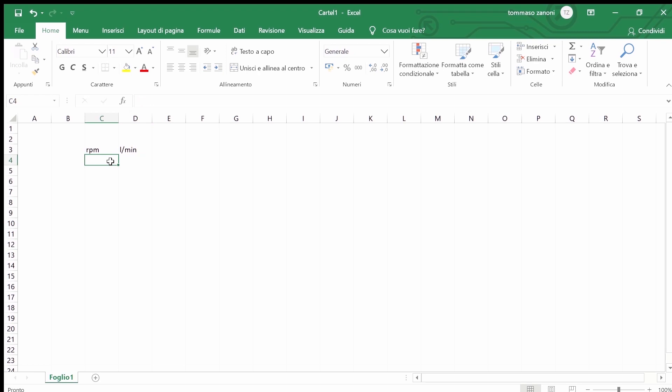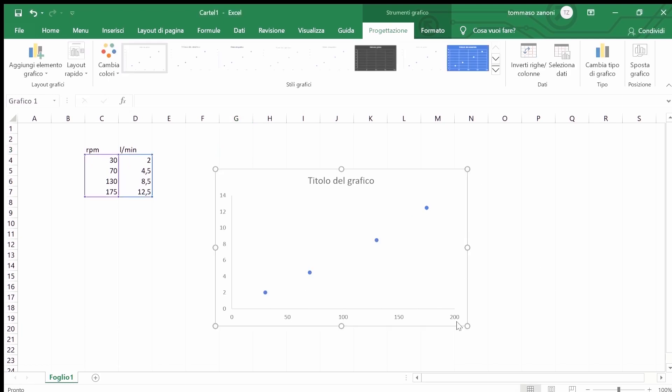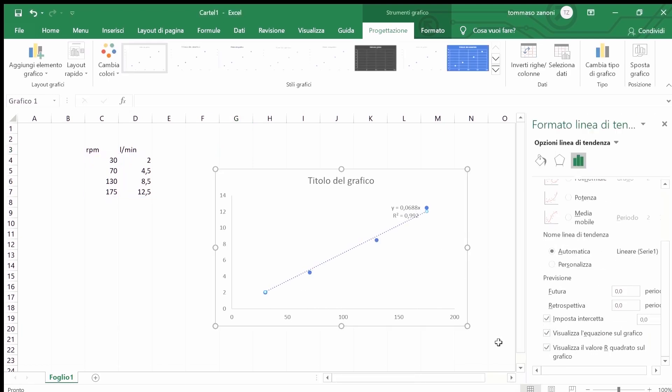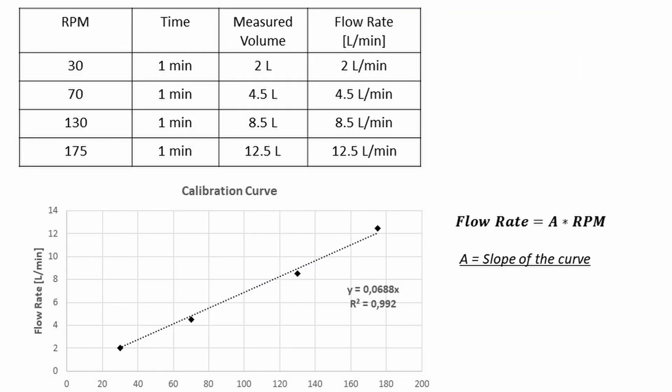Once the calibration has been completed, enter the measured values on a worksheet organized in a graph with the nominal values set on the pump in the x-axis and the volume actually quantified by means of the cylinder in the y-axis. Insert a linear correlation between the points and the origin and calculate the slope. Follow the mathematical steps shown in the overlay to obtain the correct pump setting and insert it into the pumps.